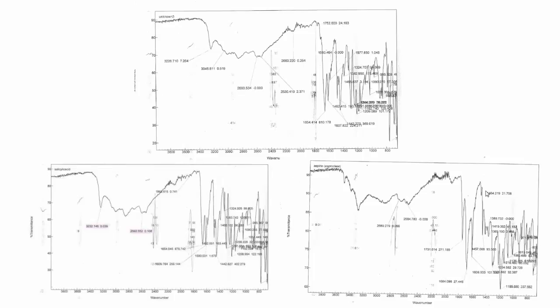Unknown 3. This compound contains two chemicals which we have identified. The peak at 2593 corresponds to the carboxylic acid OH stretch, which comes from the salicylic acid and is confirmed by the IR spectra of salicylic acid. The peak at 3226 on the unknown spectra corresponds to the hydroxylic OH group, which indicates the presence of salicylic acid, as it contains both a carboxylic acid and a hydroxylic group.